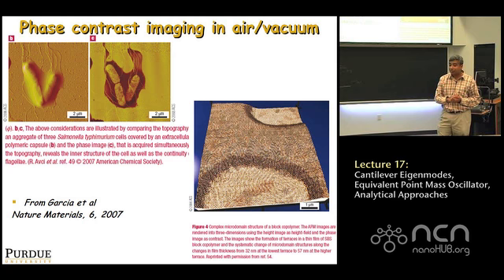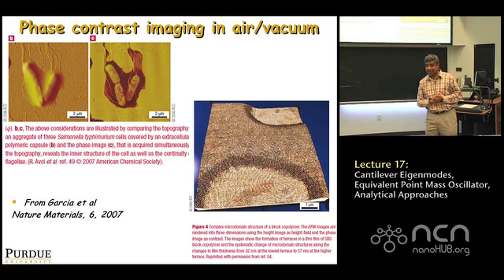Is it energy dissipation? No, it's not, because they haven't plotted sine of the phase lag, right? So you cannot say just by looking at this if the darker parts are more or less energy dissipation. This is the problem. You see contrast, but to extend the physics to get an idea where there is more or less, you need to be sure you're dealing with phase lag. You need to plot sine of phase and so on.